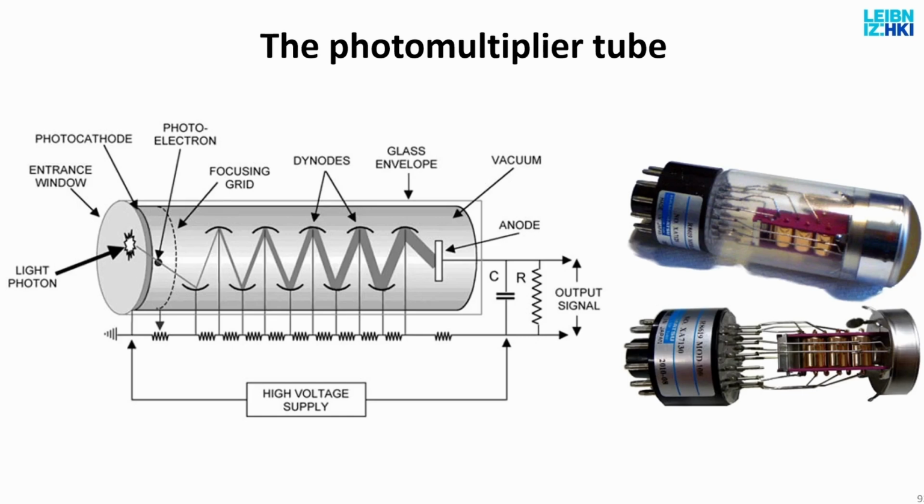So when they hit this metal, they will knock out, let's say, 2 electrons. And then you put positive voltage here, so now they are happy and they come back here. And now they knock out 4, and then 8, and then 16, and so on and so forth. So what you are doing is, it's my 10-minute warning. So what you are doing is multiplying the photons.